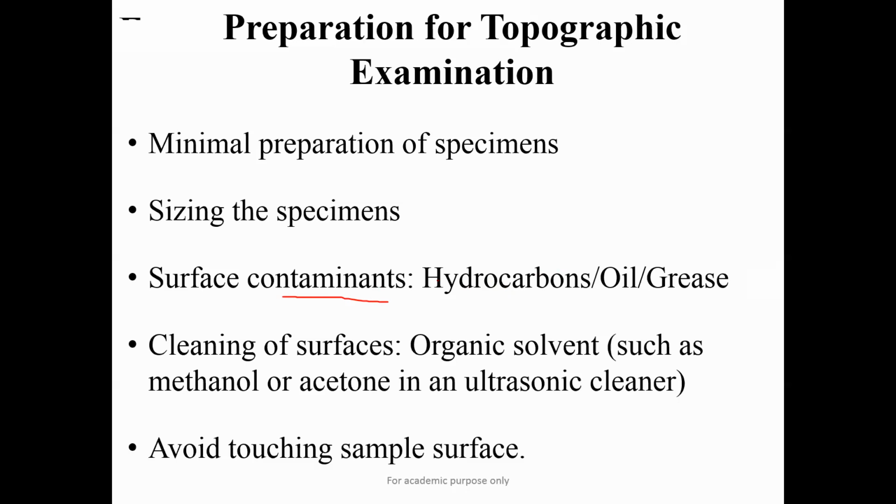And before taking our sample to the machine, we should clean it with some organic solvent such as methanol or acetone. Take some amount of methanol or acetone, dip your sample and put it in an ultrasonic cleaner, let's say for 5-10 minutes, and then take the sample out with the help of tweezers, but make sure you are not touching the sample after cleaning.